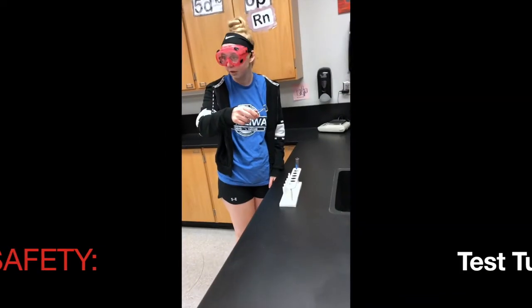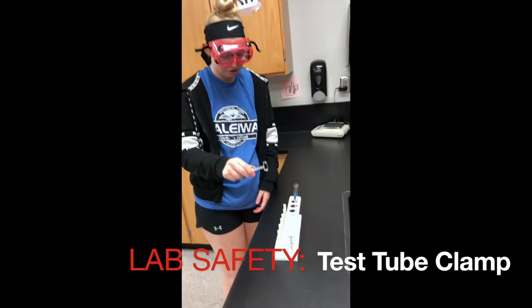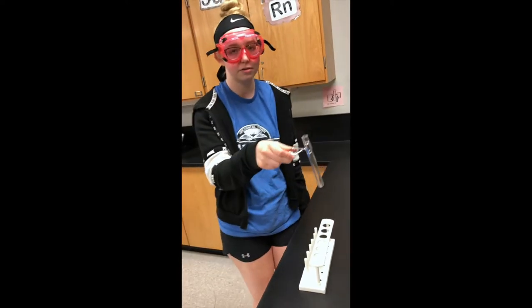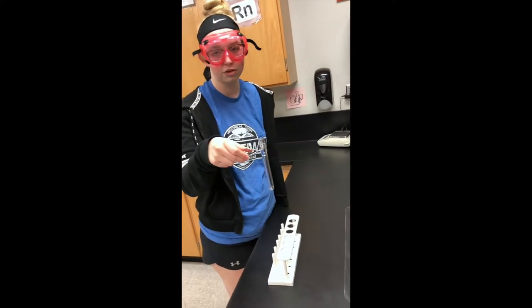This is a test tube clamp. You use it by squeezing the two circles and grabbing the test tube. Why we use it? Because sometimes the test tube can be hot.